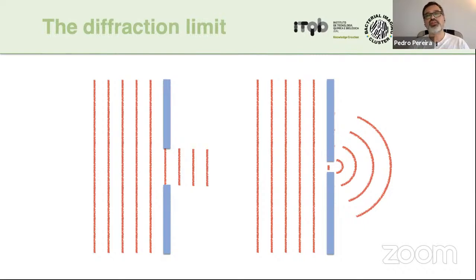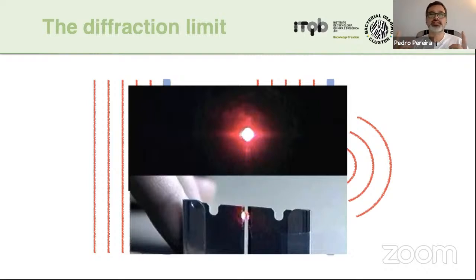What I'm going to show now is a movie of a classical experiment that shows the diffraction limit. And it's done by Ricard Henriques, now a PI at IGC and my former boss, which basically shows two slits. So slits are these metal things here. And this is a laser. And I'm going to close the slits, or Ricard closed the slits, better said.